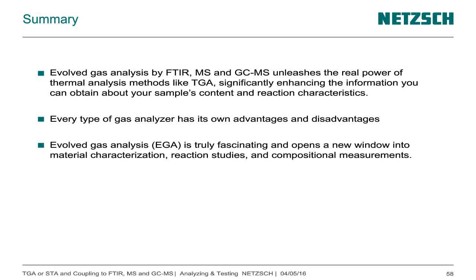Okay, thank you. Next question: is it possible to detect and quantify fluorine-containing gases like hydrogen fluoride? The question says hydrogen fluorine, I assume HF. So HF, it should be possible.